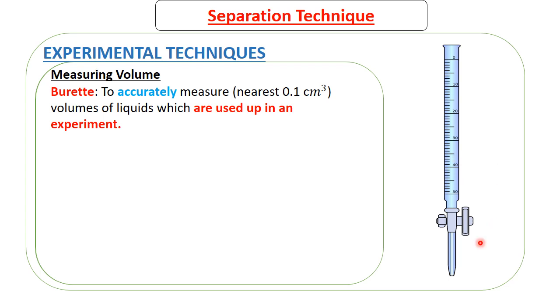So when you are doing an experiment, you can use this to lock here so that there is nothing that moves between this part and this part. So you can put whatever experiment you are doing, whatever reaction you want. You can put a beaker, for example, if you're using a beaker to do the reaction, or it can be anything, or a petri dish. You can put it here, so long as that's where you want your reaction to occur.